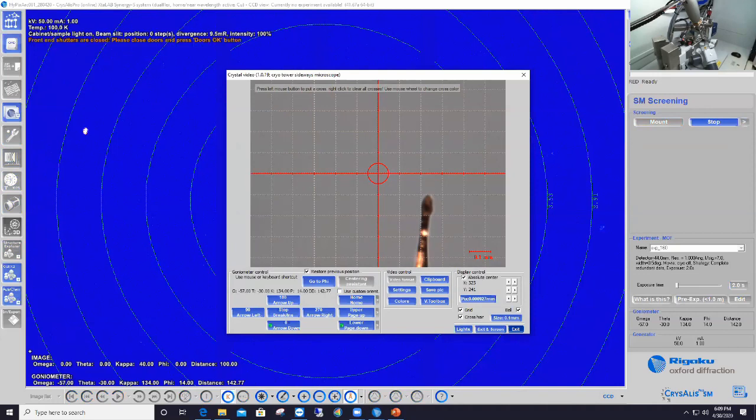And let me explain to you what happened here. So basically, the goniometer just oriented the pin, which is mounted on the goniometer head and on which the crystal is mounted, in a horizontal way. So the pin now has the orientation shown by my finger here.